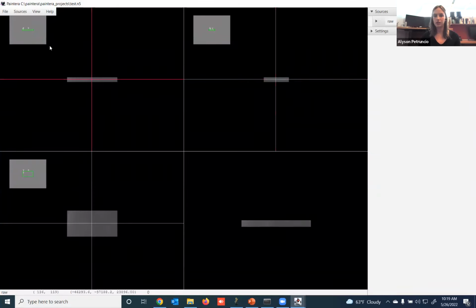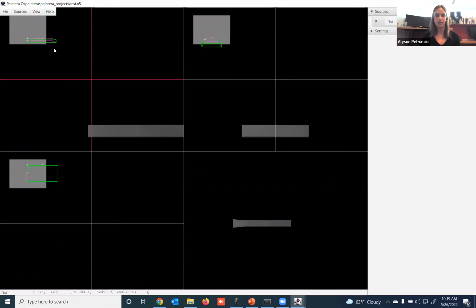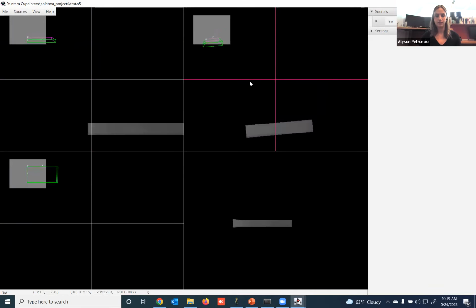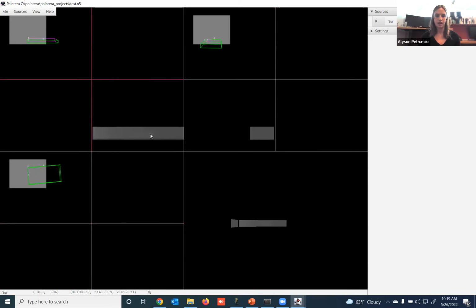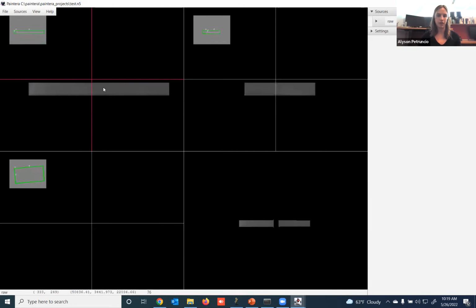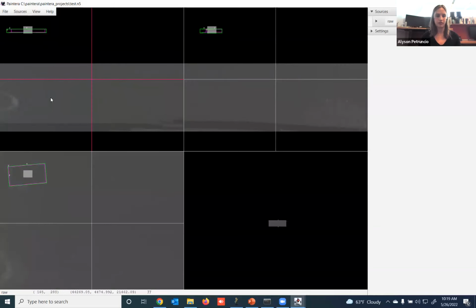All right, so now I'm going to zoom in a bit by using the arrow keys. I can also use arrow keys in different orthogonal planes to navigate. And I can also click and drag by using both mouse keys. All right, so we're zooming in.